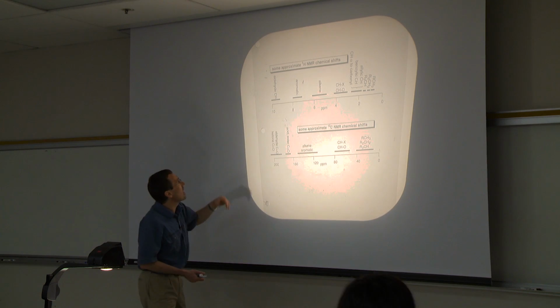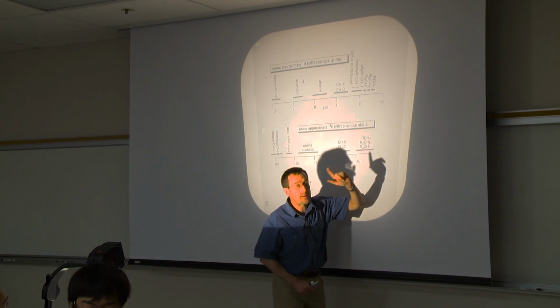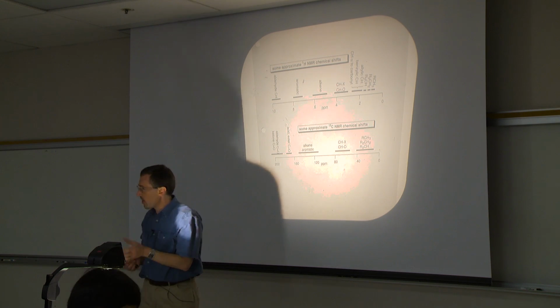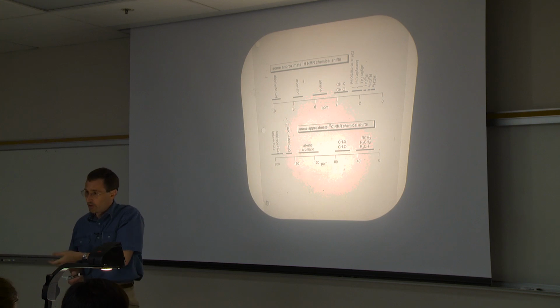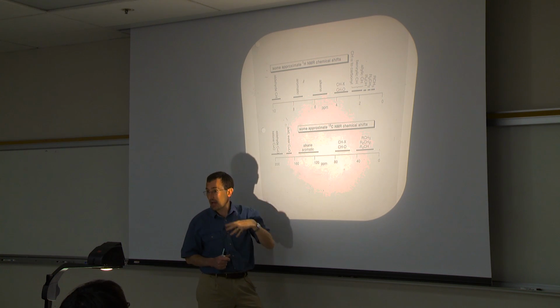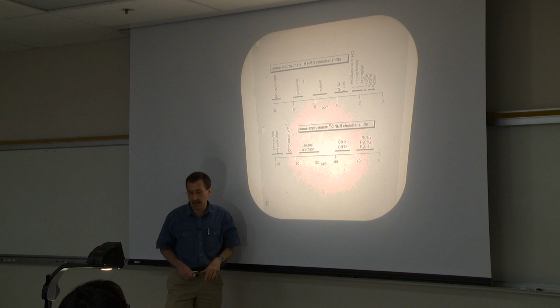Same thing on the proton NMR. I'll look at the alkyl stuff. Oh yeah, I see a methyl triplet. I see a methyl doublet at about 0.9 parts per million. Oh, I see some stuff from about 2 to 3 parts per million. That might be a singlet, say at 2.1 parts per million, 3 hydrogens. Maybe it's a methyl group next to a carbonyl, or maybe it's a methyl group off of a benzene ring. In the midfield region, oh yeah, we have maybe a hydrogen on a carbon connected to an oxygen, alkenes, aromatics, and the like.